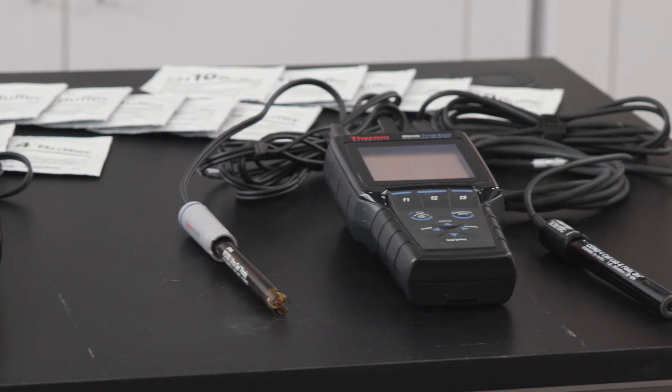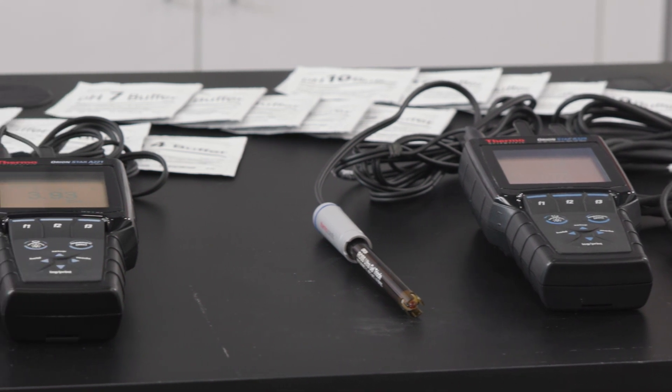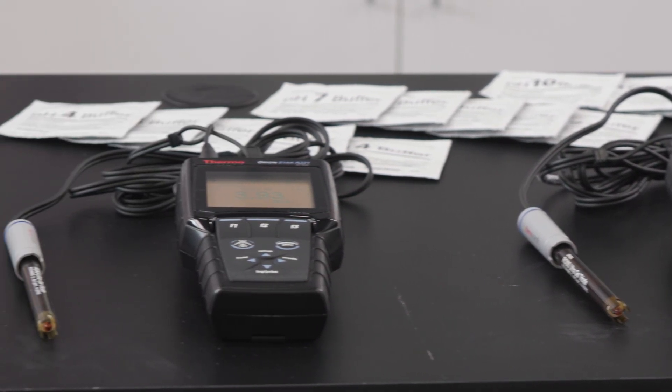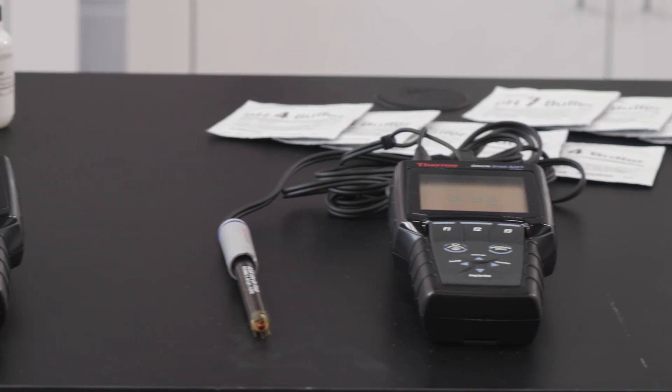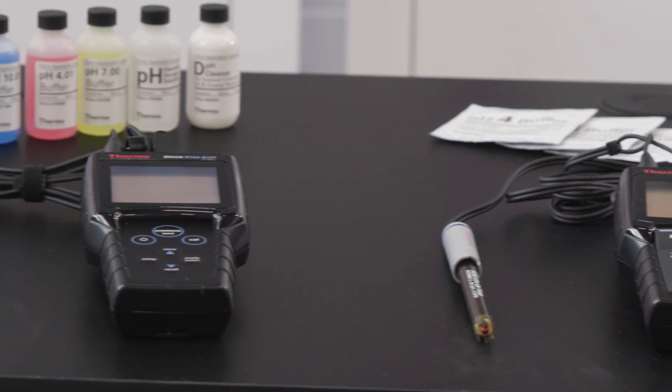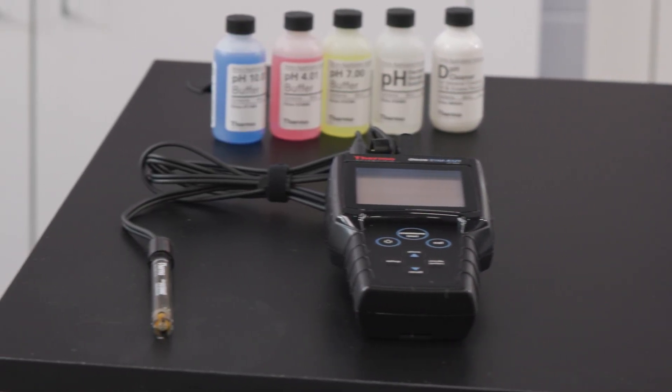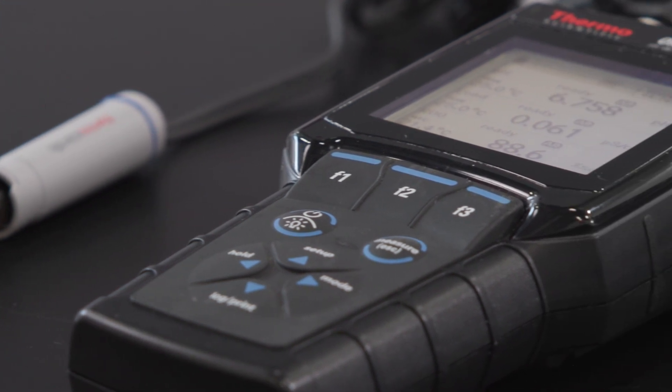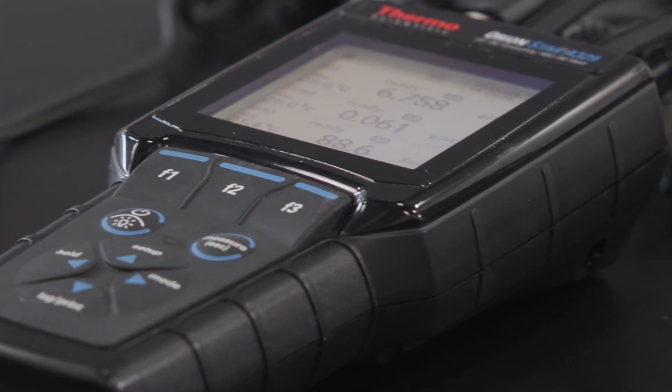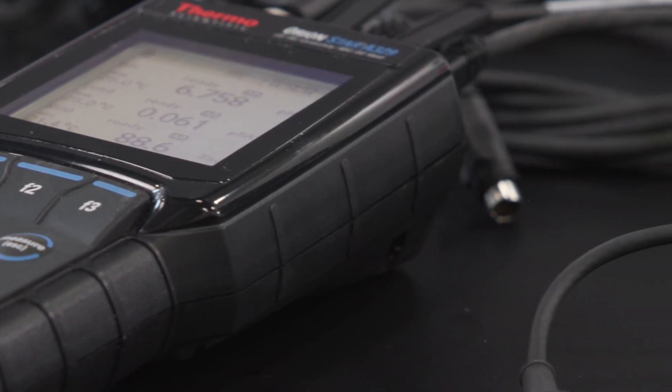Finally, budget is the last factor to consider before purchasing your portable pH meter. Your budget will dictate the type of meter you can purchase and the features you'll unlock access to. Assessing the trade-off between cost and quality is essential to ensuring that you've invested in a reliable and long-lasting instrument.